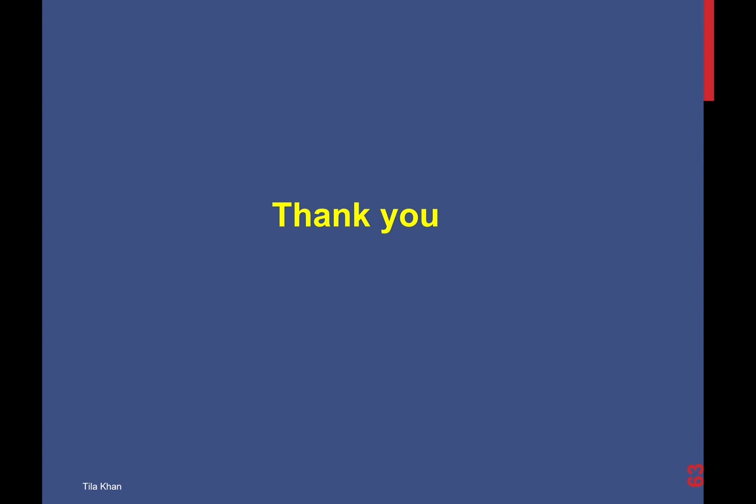So I would like to thank you here for your patient listening. And the main point about this whole presentation is that we cannot dispose of anything and everything that is coming out from our labs out in the open. And so there has to be a regulated protocol that we all need to comply with, and this will help protect our lives as well as others' lives, and it will help keep our environment clean, our earth clean for others to live.